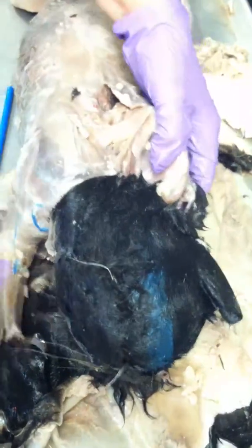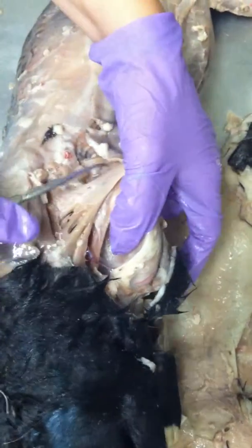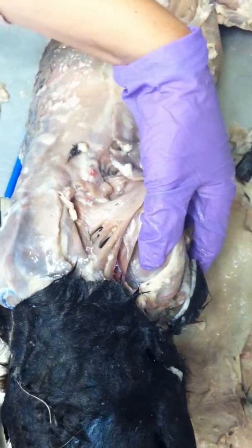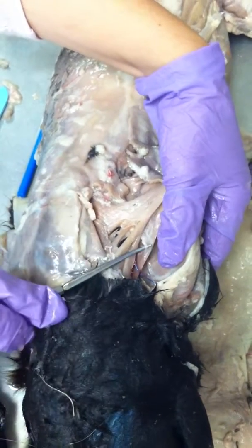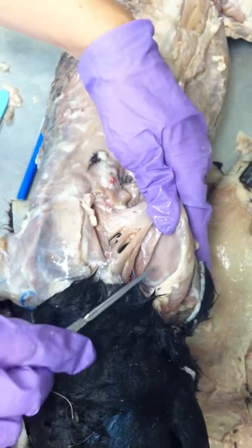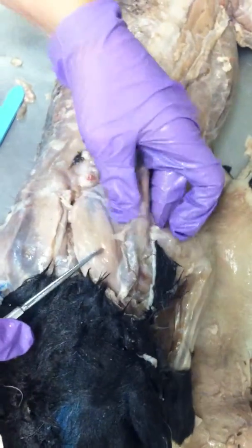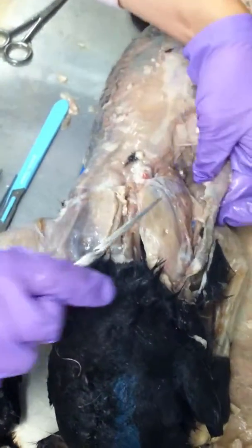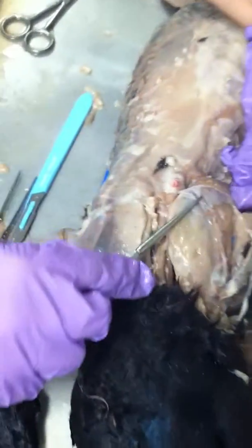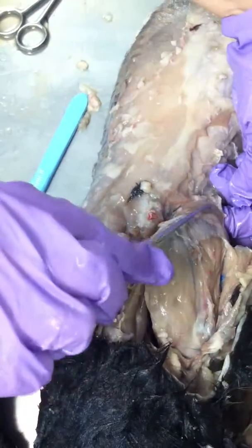Looking to the deep aspects of the scapula, this is rhomboideus capitis right here, running to the head. Okay, and this is just rhomboideus. In humans, we have rhomboid major and minor, which is the rhomboideus muscle in the cat, and they have an extra muscle called rhomboideus capitis. The muscle that sits in the subscapular fossa is subscapularis. The one above the spine of the scapula is supraspinatus, and the one below it is infraspinatus. Finally, you have this chunk of muscle at the inferior angle that will attach to the humerus. This is the teres major.